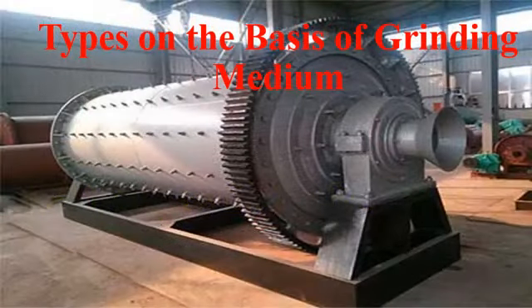Another type of the ball mill apparatuses is based on grinding medium. Dear student, the grinding medium means the material, the balls, which are used to grind a bulk material. So these types of ball milling apparatuses are based on the nature of the material which is used as the ball.